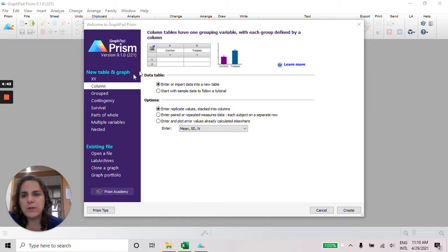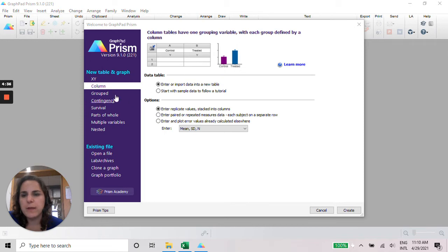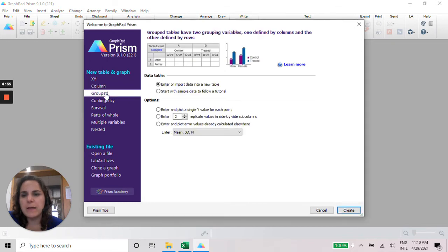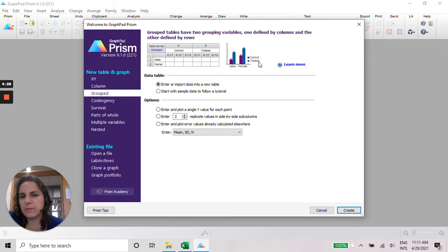Different from this one, in this case you just have one condition or control or treated. I need this one, the grouped, and you're going to have if they are like by gender or by treatment.